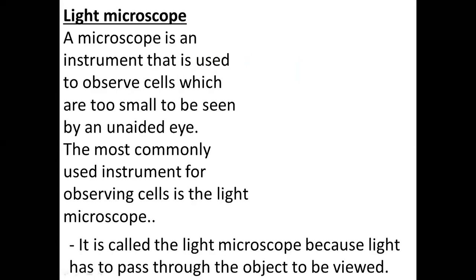Talk of microscope and microscopy. A very tricky area indeed. You realize that we normally start microscope work in Form 1, but by the time we get to Form 4, maybe because of constraint of time, hardly do teachers have enough time to polish on microscope. So what I want us to do today is to go through some things that people may take for granted, and you realize that they're very, very vital.